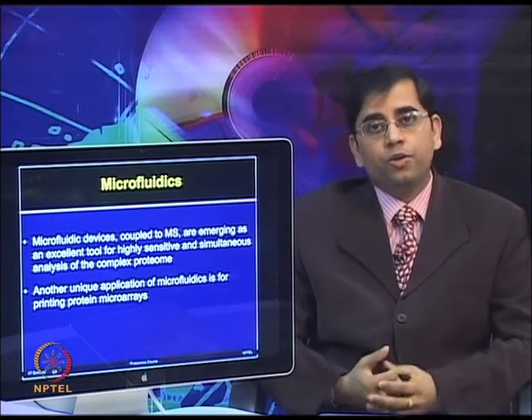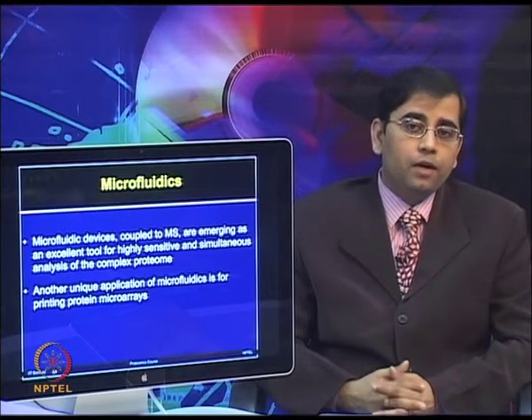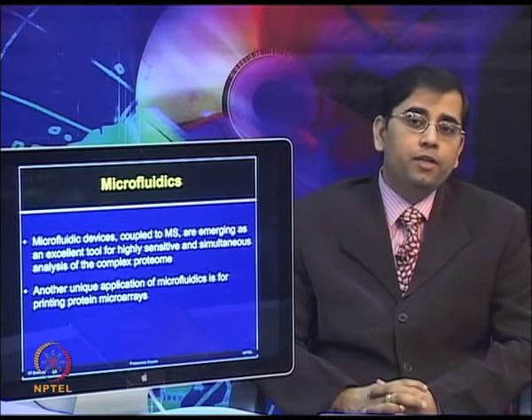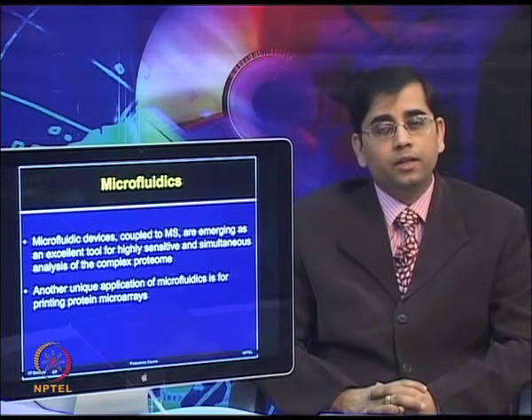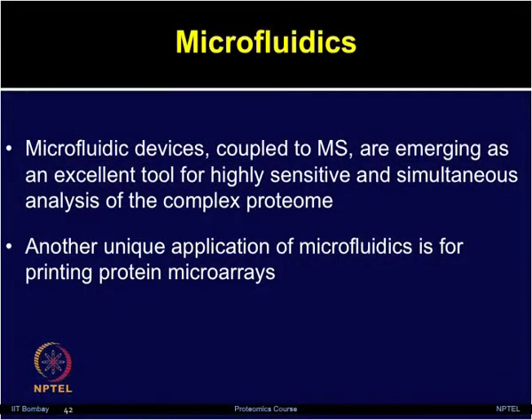There is a lot of research going on in this field, where there is an increasing interest of applying microfluidic devices and coupling them with mass spectrometry, which can provide an excellent platform for highly sensitive and simultaneous analysis of complex proteome.